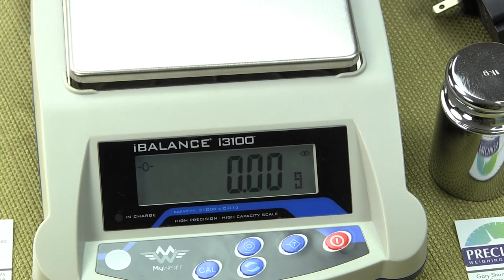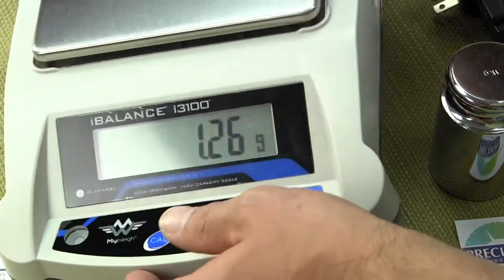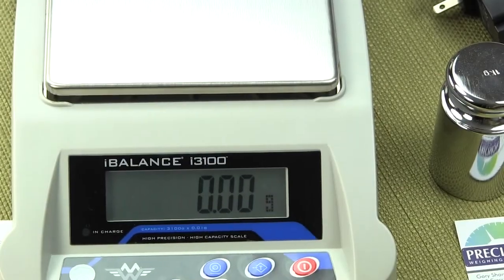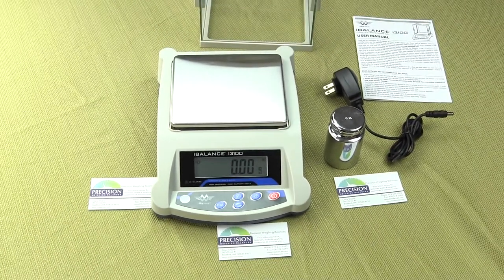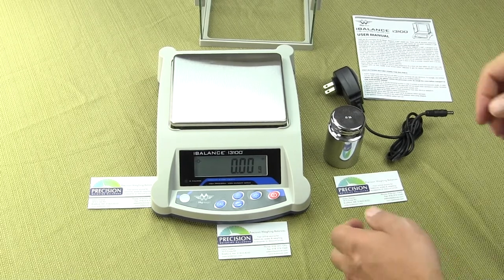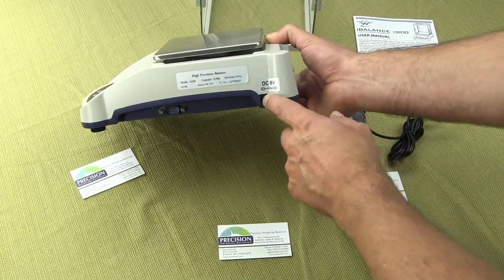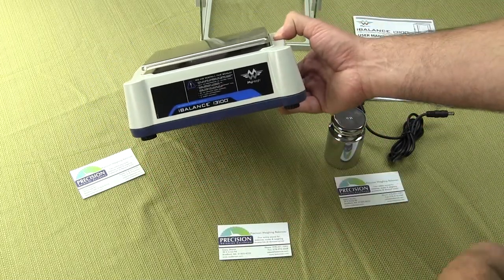The selling points on this unit: simple and low cost. This is a strain gauge based scale. If you are looking for top-of-the-line performance, you definitely want to go with a force restoration balance, but in today's economy people are looking for value and affordability. A force restoration balance at 3100 grams by a hundredth of a gram would cost well over a thousand dollars. The scale does have an RS-232 interface — if you are computer savvy you can use it, though support for it is limited. It also has a port on the rear for the AC adapter.